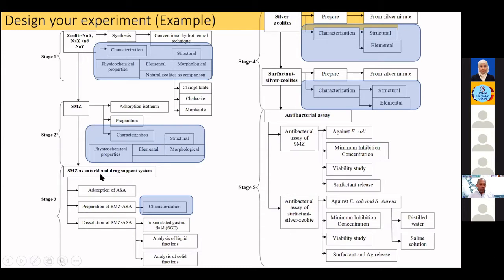In my PhD, we used this zeolite as a drug support system. When we want to study the effect of this material in the human body, what we can do is put it in simulated gastric fluid, and then we analyze the solid fraction using almost similar characterization techniques. Same goes for this one.